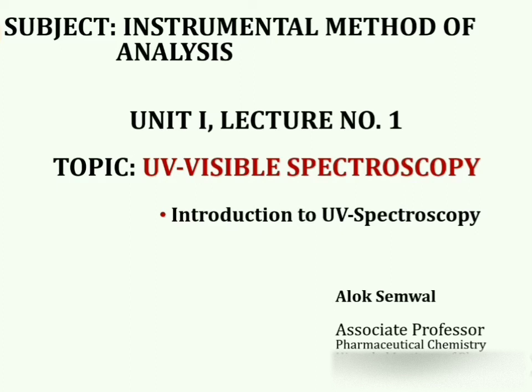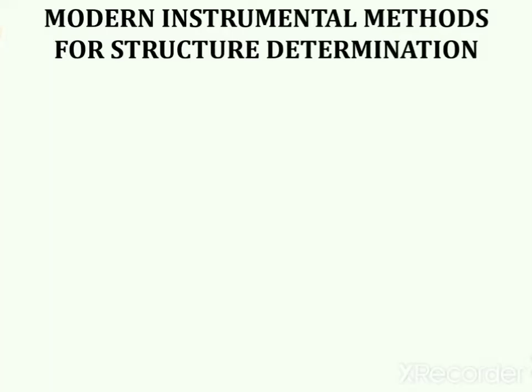Today I'm going to discuss spectroscopy and an introduction to ultraviolet spectroscopy. So before starting ultraviolet spectroscopy, it is very important to know about the modern instrumental methods which are used for the determination of structures of various compounds. There are various methods which are used for structural determinations.